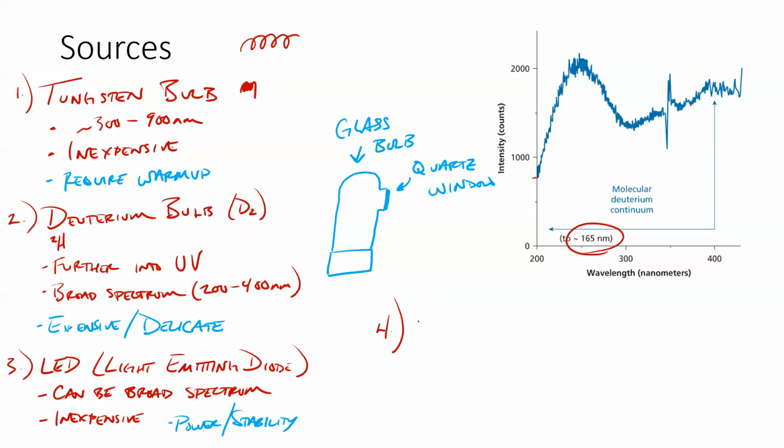The last source is a xenon flash lamp. Right. So if any of you have a camera other than your phone, it probably has a flash built into it, right? Those flashes are little glass envelopes full of xenon, usually. If you have a fancy car, you might have xenon headlights in it too. When xenon's excited, it produces a pretty broad white spectrum, and so you get a lot of power. In a flash bulb, you get a lot of power in a short amount of time.